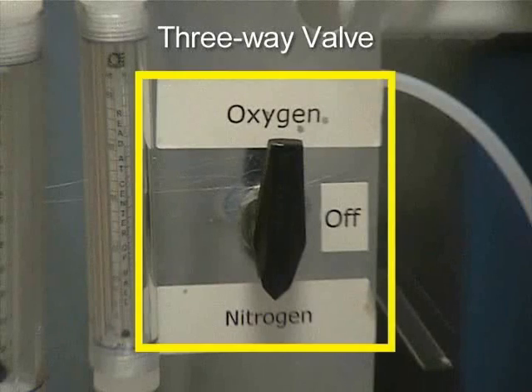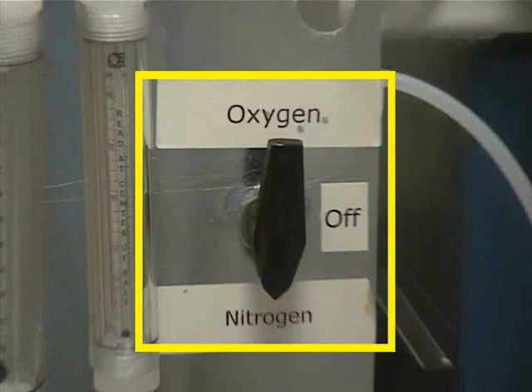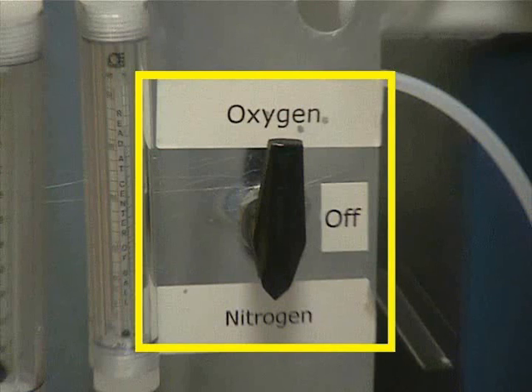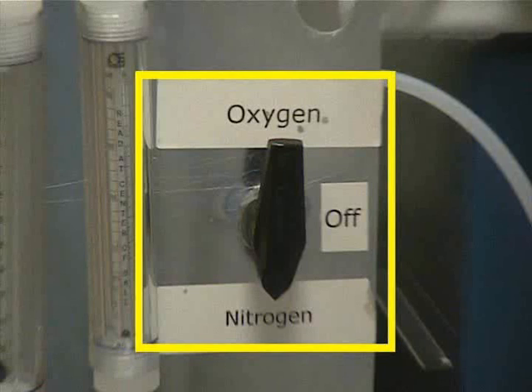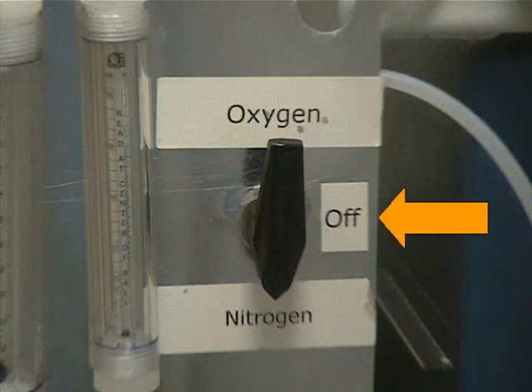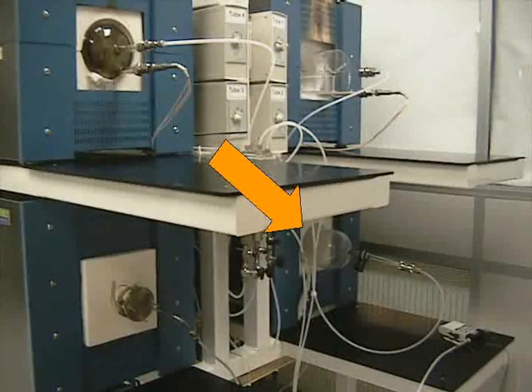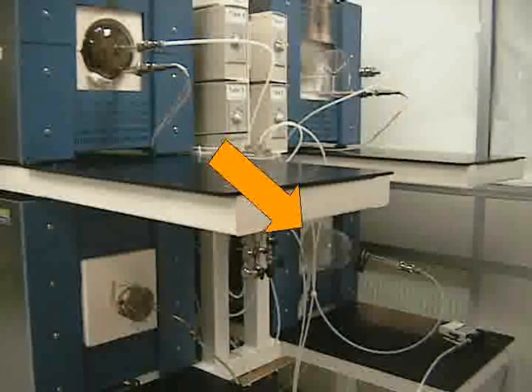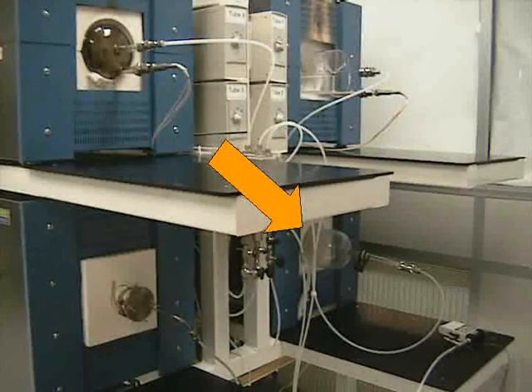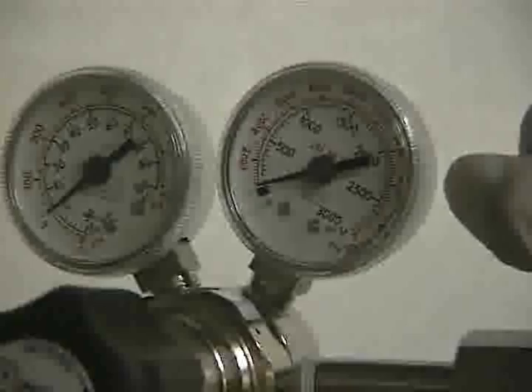Just to the right of the flow meters is a three-way valve. This valve controls which gas flows into tube two. The two selectable gases are oxygen and nitrogen. The narrow end of the handle should point to the gas chosen to be used. When tube two is not in use, the valve should be turned off. When you use furnace tube two, which performs oxidation, you must make sure that the oxygen cylinder in the chase behind the Lindbergh Furnace is on.